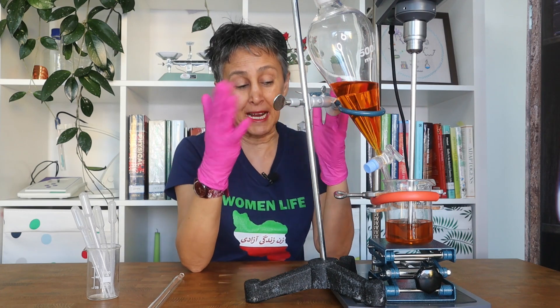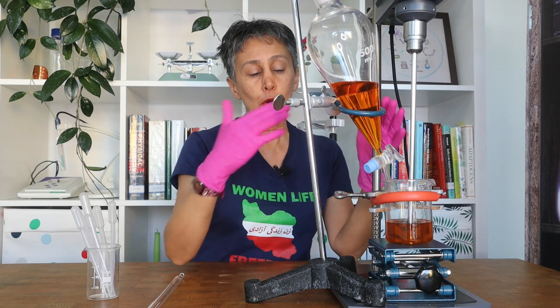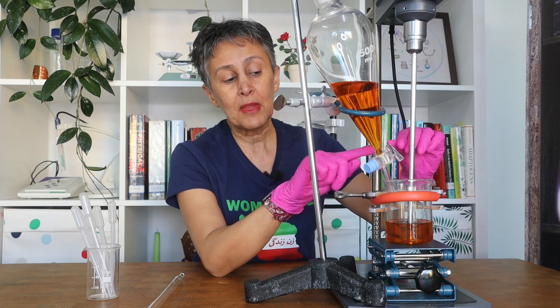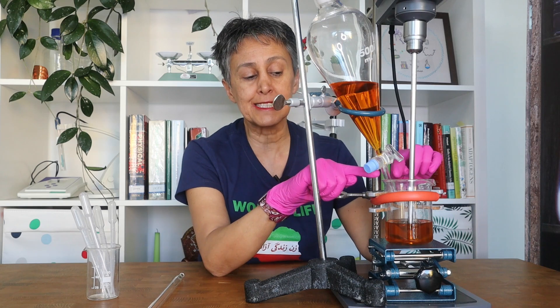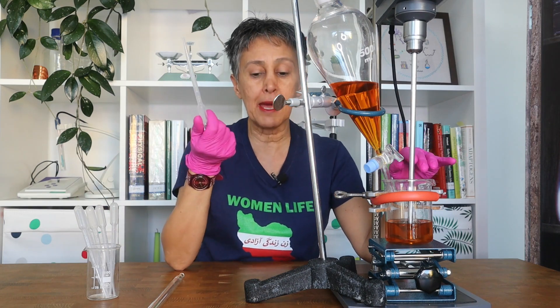Those of you who have a background in chemistry and life science will know these funnels. I have placed the tail of the funnel into my beaker and adjusted the valve so that it drops very gradually and slowly into the beaker — almost the same system as using a pipette.